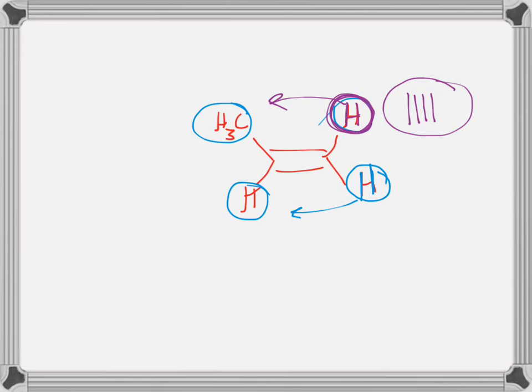The blue hydrogen is different from the red hydrogen, which means they split differently. This is probably the most common place that you'll see complex multiplicities. Terminal double bonds. And it almost always shows up as a doublet of doublets. Don't have to be happy, but you have to accept it. Questions?